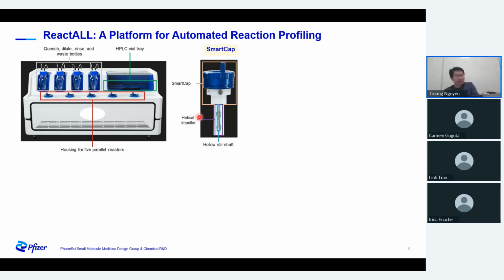So it has a helical stirrer at vial scale. It basically mimics overhead stirrers to avoid grinding and attrition. So it's a very good mimic of an overhead stirrer, compared to the reactions that people run in vials, which use a stir bar.